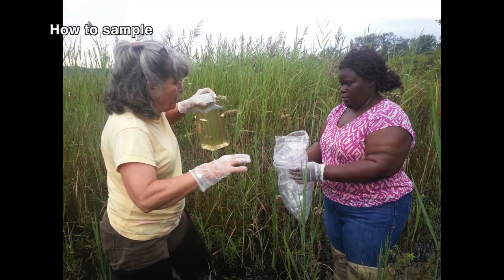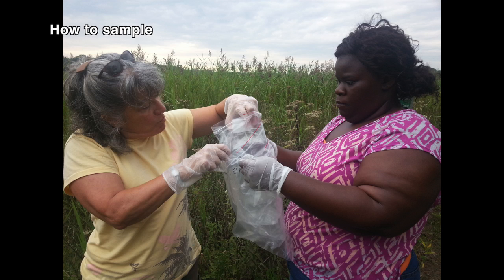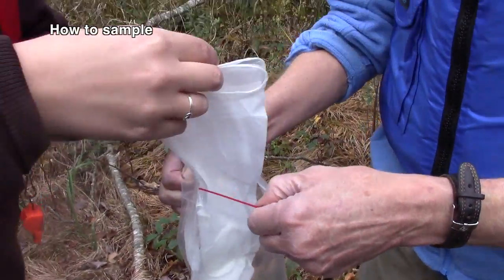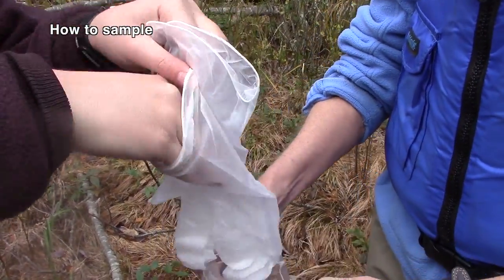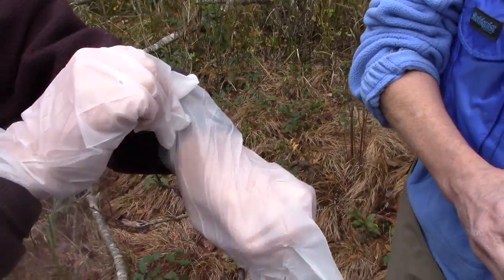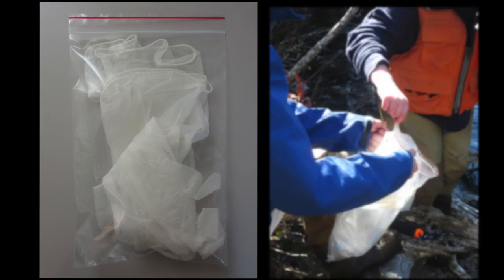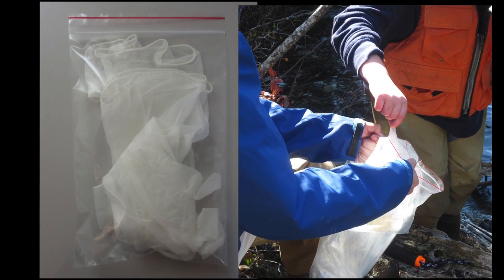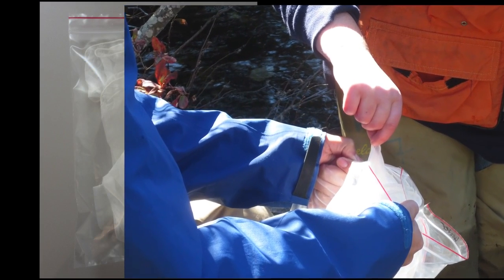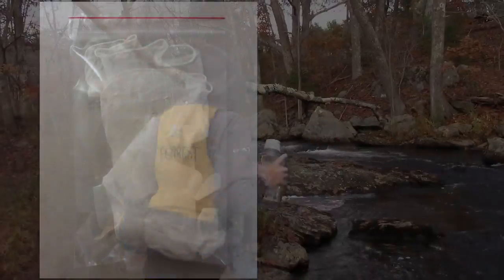You will need two people to do the sampling. One person will be Clean Hands and the other person will be Dirty Hands. Dirty Hands' job is to deal with everything so that Clean Hands only touches the inner bag and the sample bottle. Your gloves should have arrived such that the wrist of the glove is facing the opening of the bag, so the gloves can be pulled from the bag with only minimally touching the wrist part, and without having to touch the palm or finger parts of the gloves, as those parts will be in contact with the sampling container.